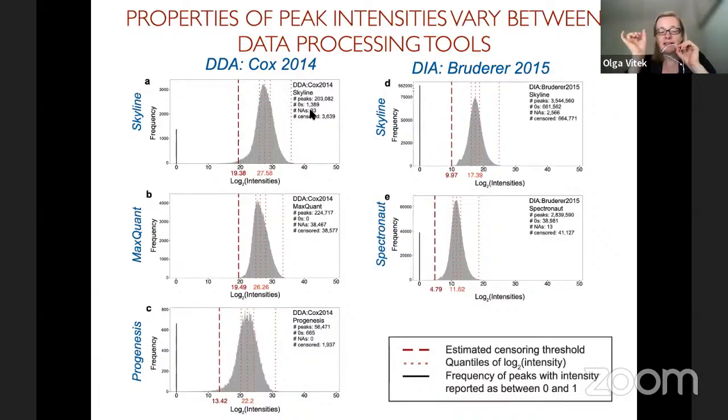For example, the peak has a strong overlap with another peak, or it's truncated, the window has cut the peak in a big part. Otherwise, it will probably integrate the area in the expected region. MaxQuant seems to be much more generous with NA and has a lot more NA than Skyline has.